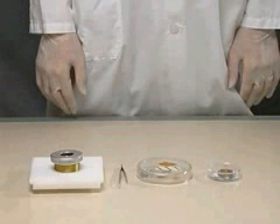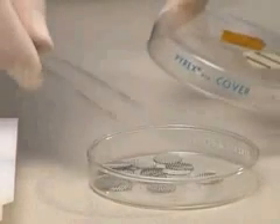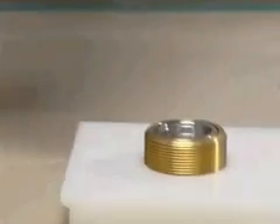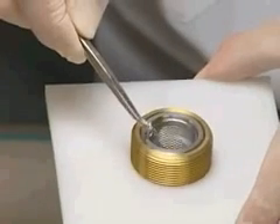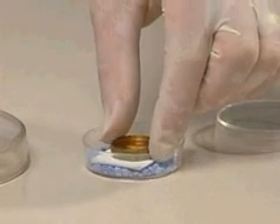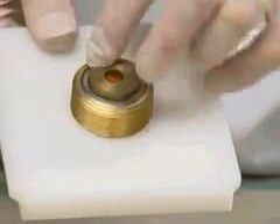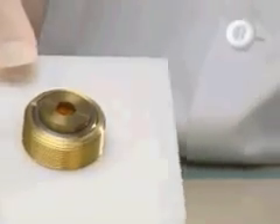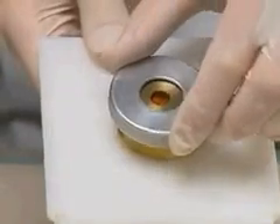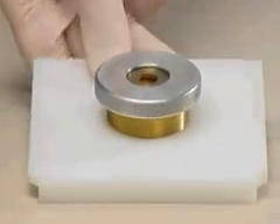Prepare the microcarrier launch assembly. Place a sterile stopping screen on the stopping screen support. Install the macrocarrier holder containing the loaded macrocarrier on the top rim of the fixed nest. The dried microcarriers should be facing down towards the stopping screen. Replace the macrocarrier cover lid on the assembly and tighten.